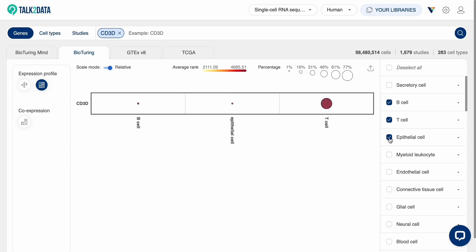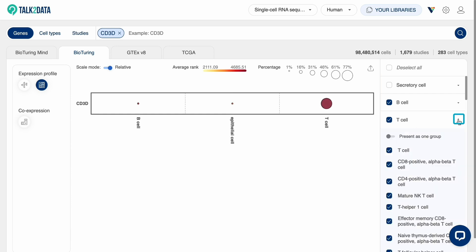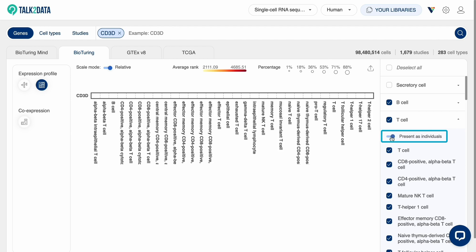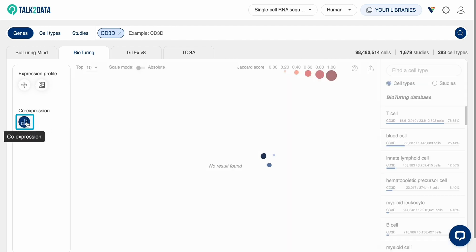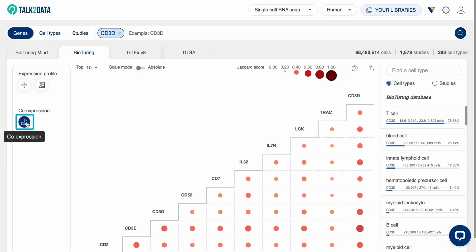Expand a cell type to view all the subcell types and choose to view as one group or as individuals. Finally, click on this icon to view the co-expression of this gene to others.